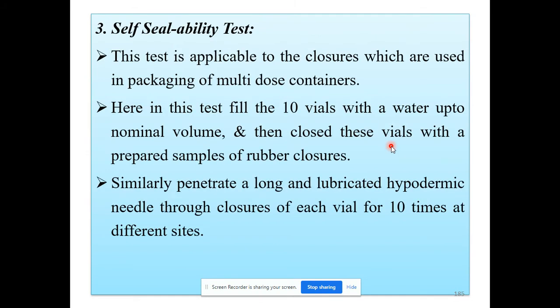The third quality control test is the self-sealing ability test. As the name itself indicates, we are going to examine and evaluate the self-sealing ability of the rubber closer.